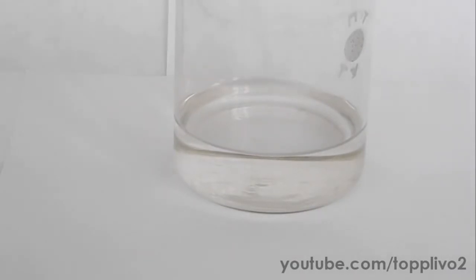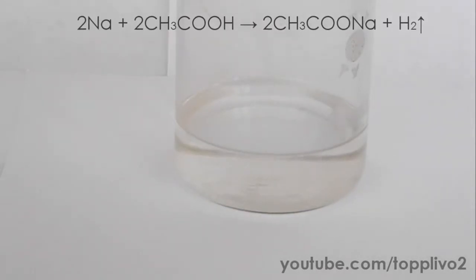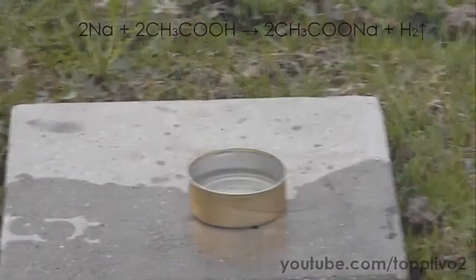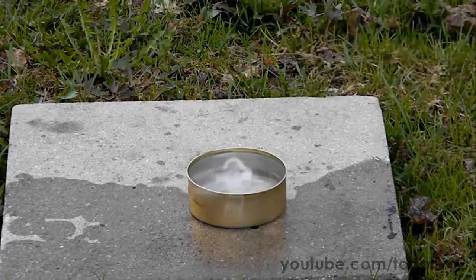Next let's view the reaction of sodium with 30% acetic acid. First sodium lights up and then the reaction proceeds the same way as it does with water. Now moving to the reaction of sodium with 30% hydrogen peroxide. This reaction again is very dangerous because sodium ignites and explodes.